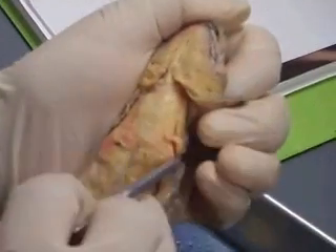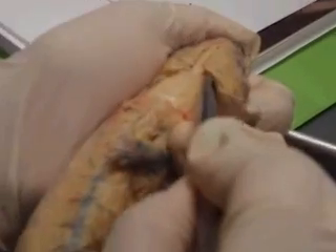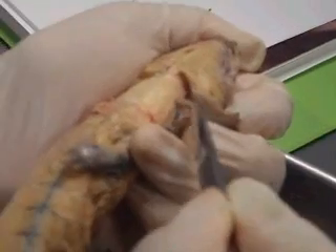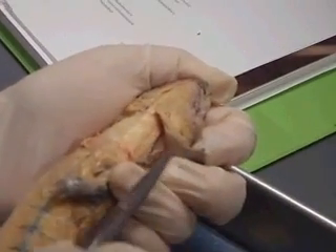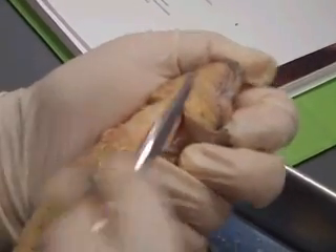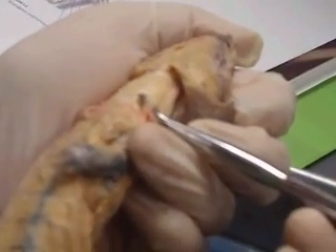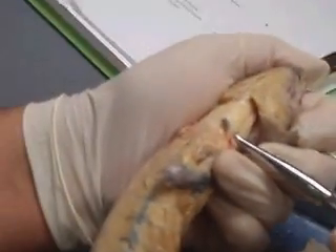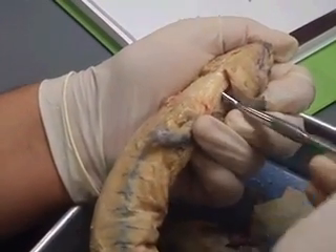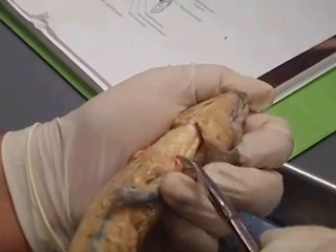If I pull this open here — the one that's running from the shoulder blades all the way up here — this is your procoracohumeralis, this long one there. The one that's running just up to this lower level of your cervicis right there, that is your omoarcual. Omoarcual, procoracohumeralis.